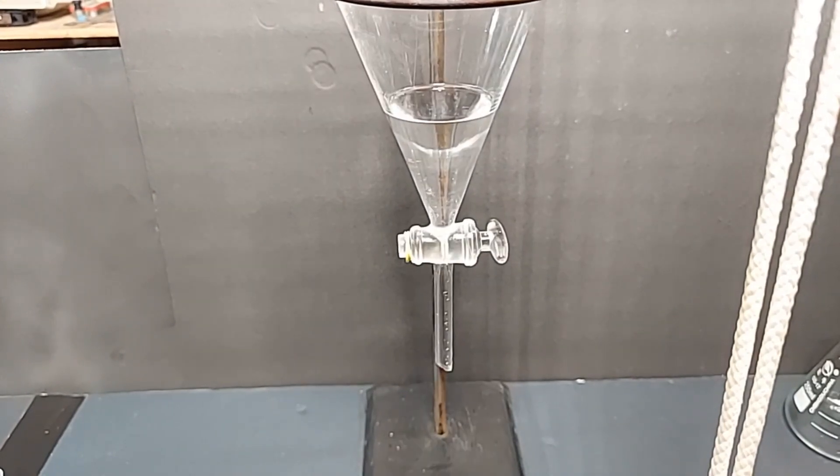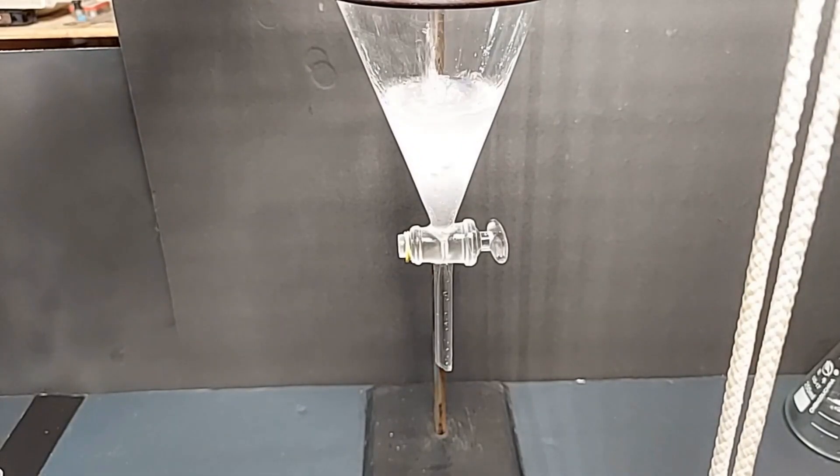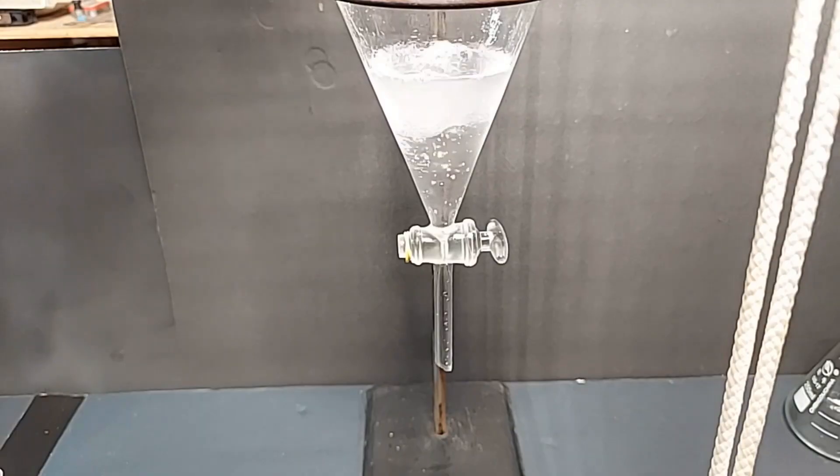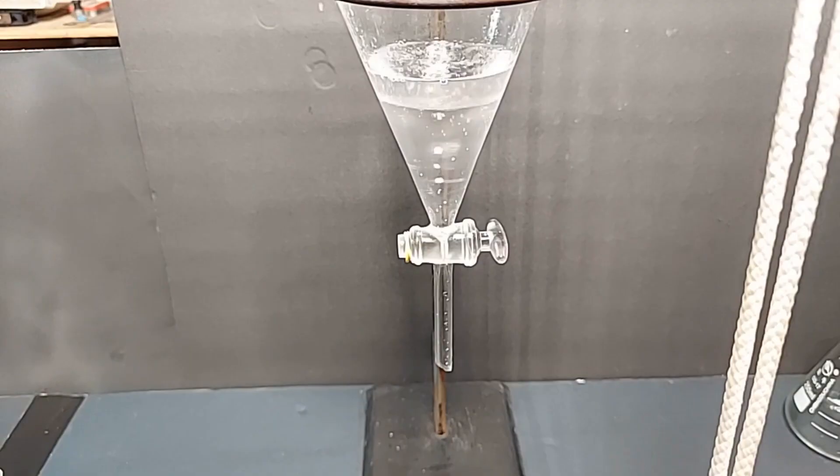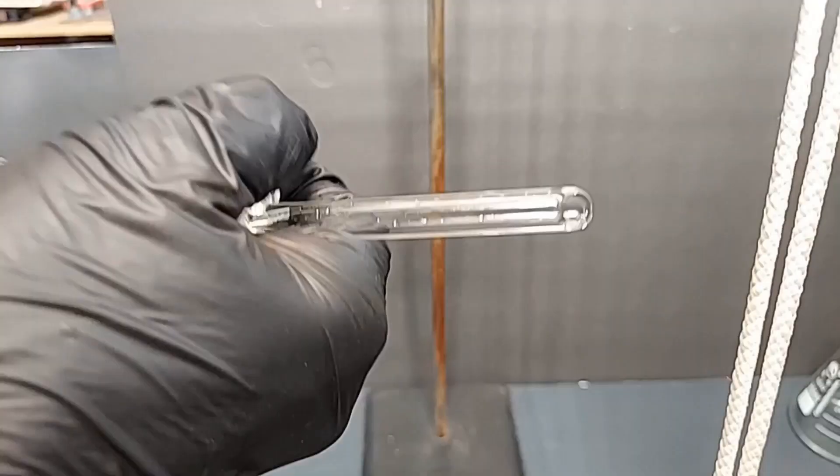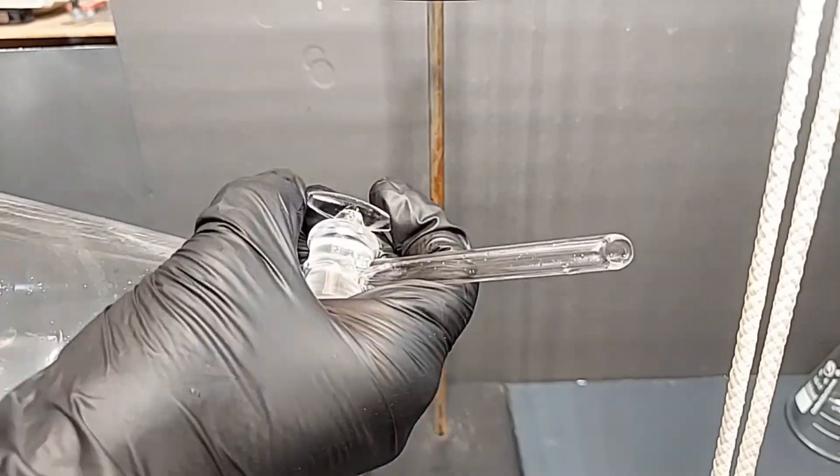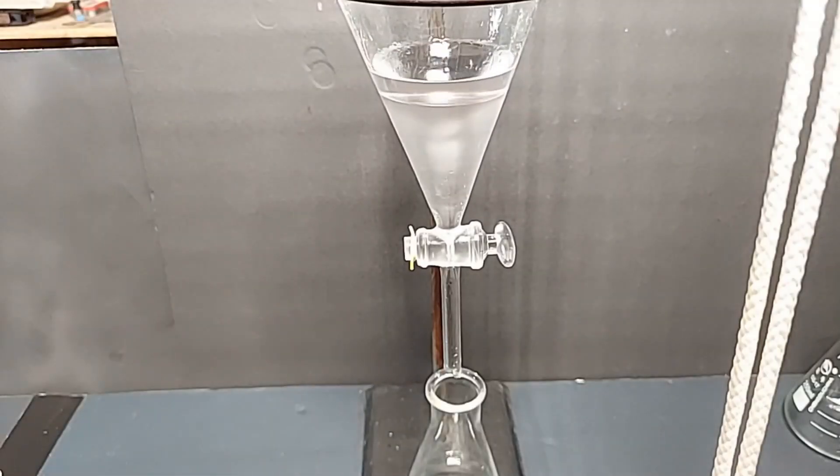I'm now going to do two washes with the sodium bicarb solution, which I made with five grams of sodium bicarb and 50 milliliters of water. I'm only going to show you one because it would be boring otherwise. This is to remove most of the acid that's in there. But you can see bubbling. With the first one, I'll be back when I'm ready to do the sodium chloride solution.